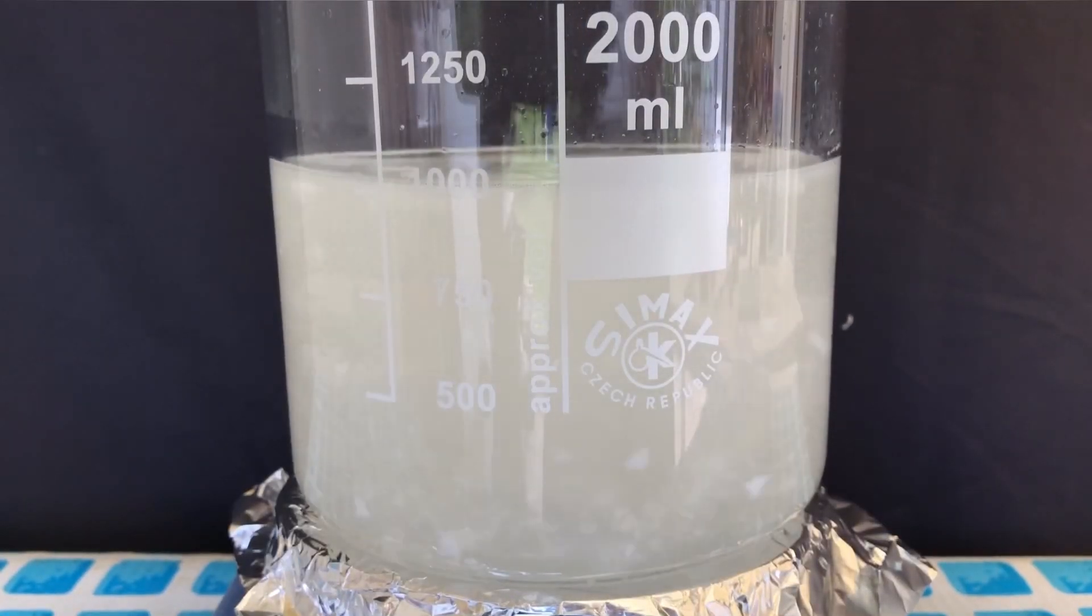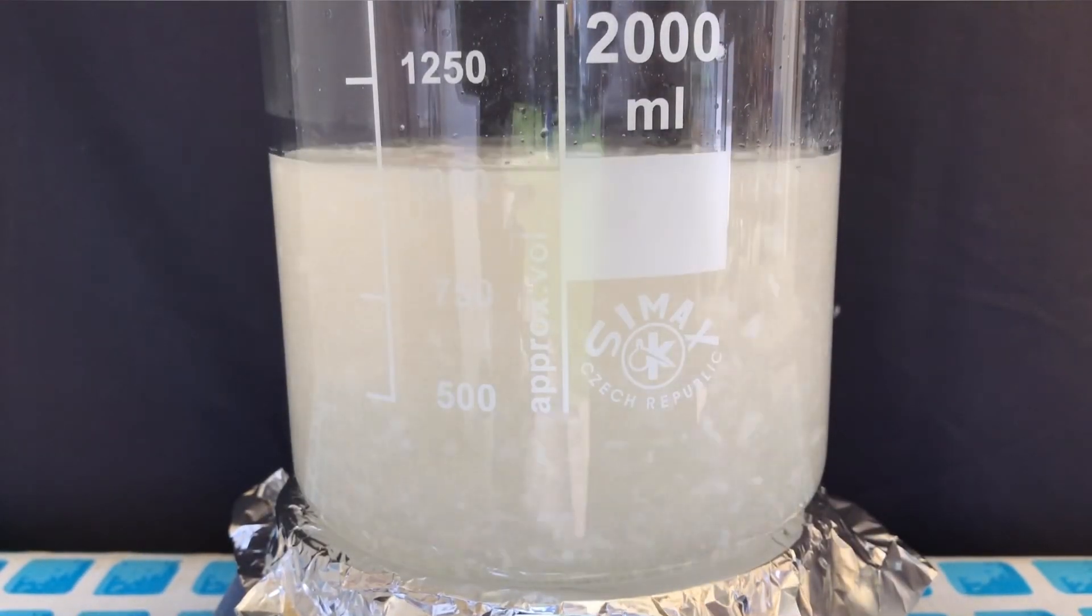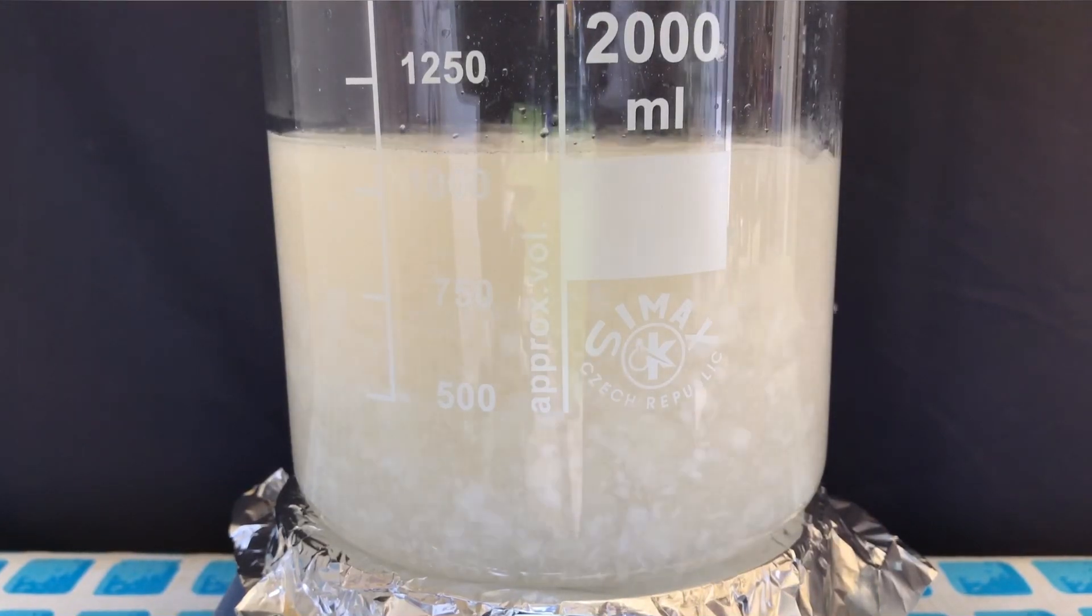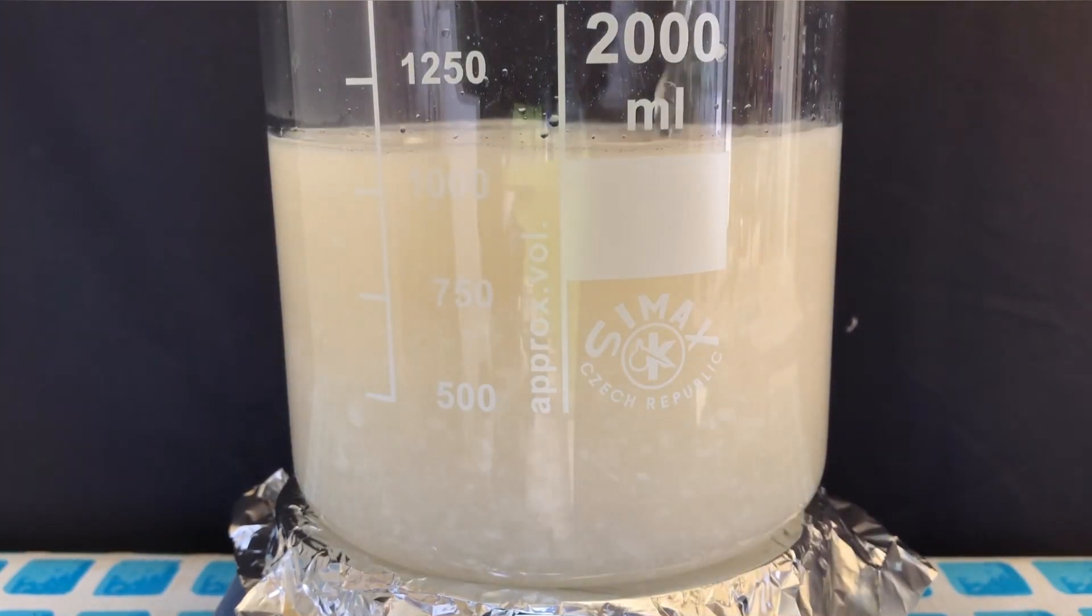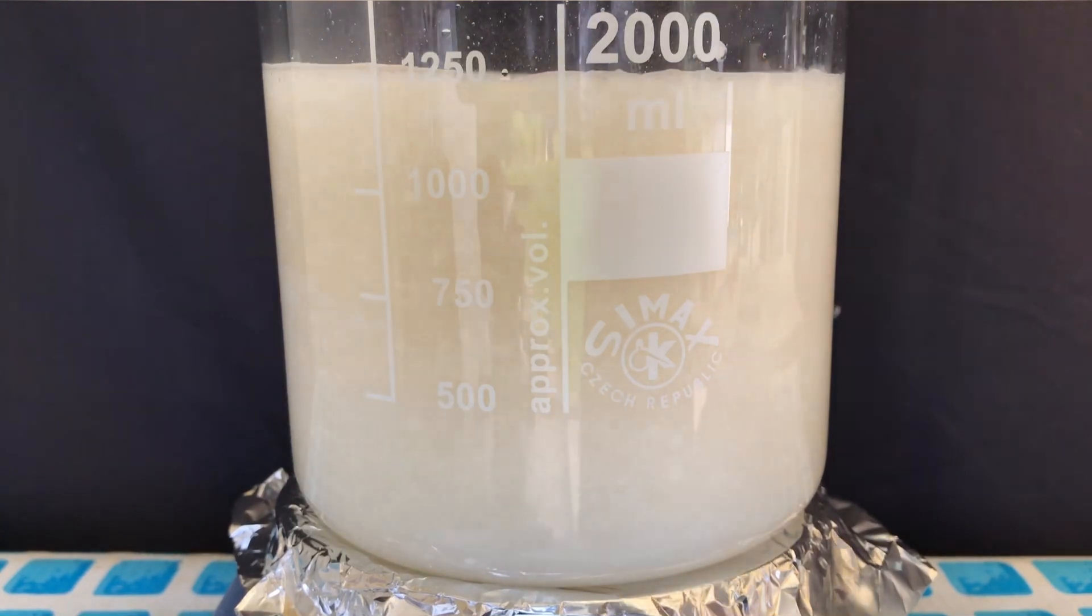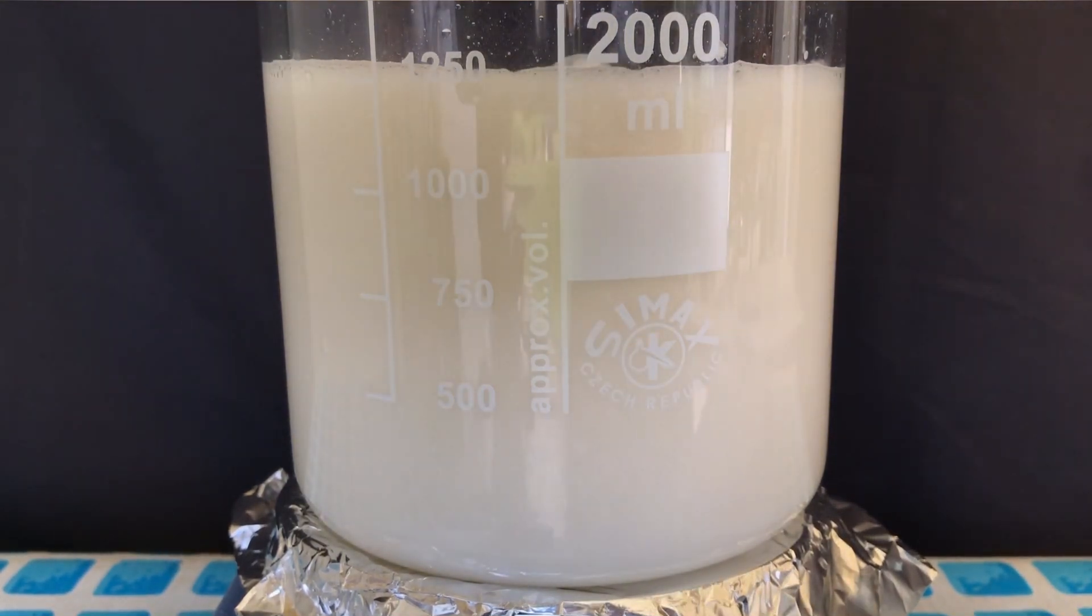The sodium hydroxide solution was added really slowly to the calcium chloride and hydrogen peroxide solution. What you see here is calcium hydroxide, which immediately reacts with the hydrogen peroxide to form calcium peroxide.